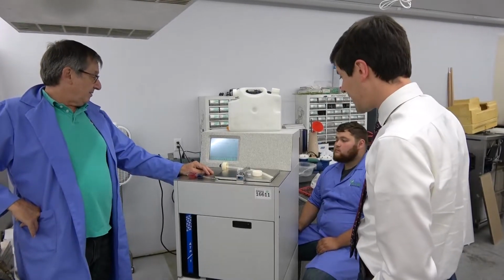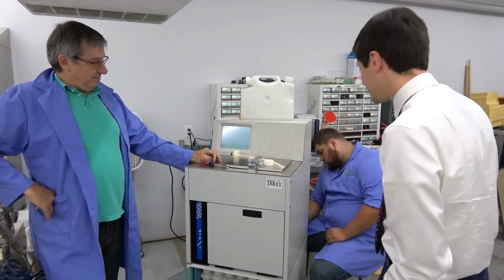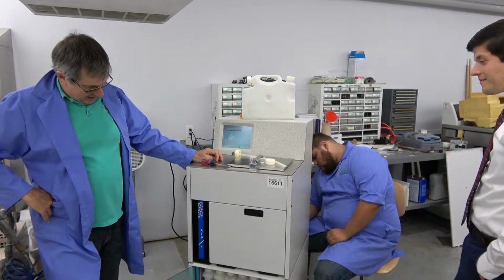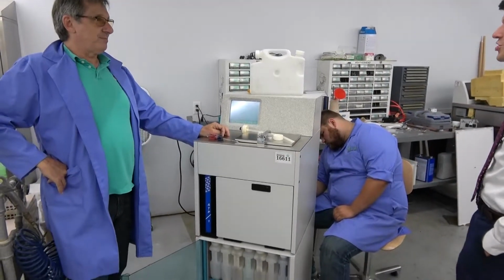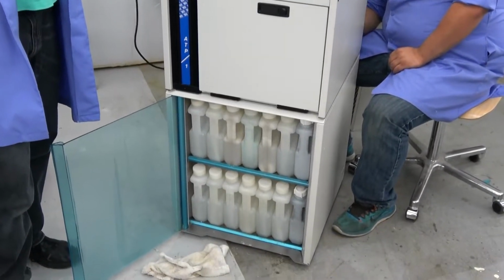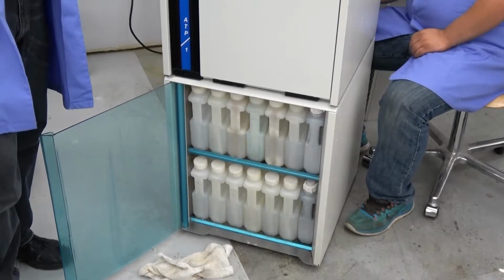We haven't got them mastered. We've had two in the history of the company. We've had two TBS tissue processors. So what are you guys doing? Can we see the guts?